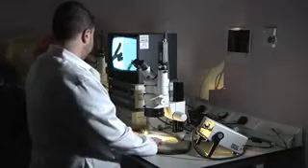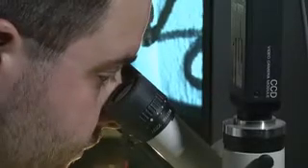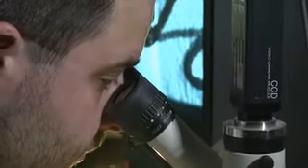In the 1970s, forensic scientists developed ways to test fountain, ballpoint, felt tip and rollerball pen inks, so they were able to tell those with different chemical ingredients apart from one another. These tests start by looking at the ink on a document through a microscope to study its colour and general appearance, which may give a clue as to the type of pen used.